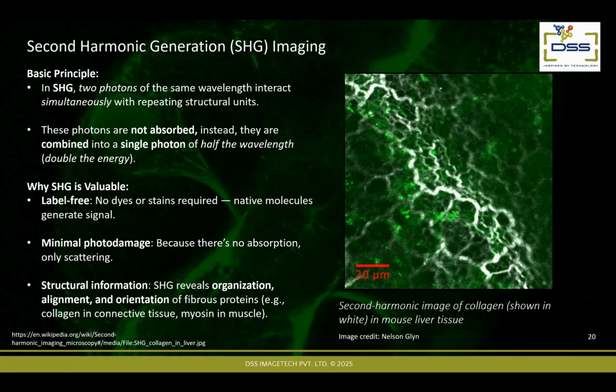Thank you, presentation. Actually, I am using a multiphoton microscope. It has only an 800 nanometer laser. It is not tunable. It has a fixed wavelength. It is a very old system by Olympus, almost 10 years old. Then in such a case, what can I do?